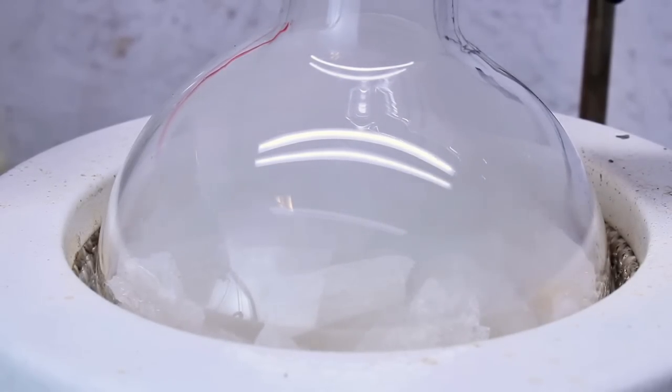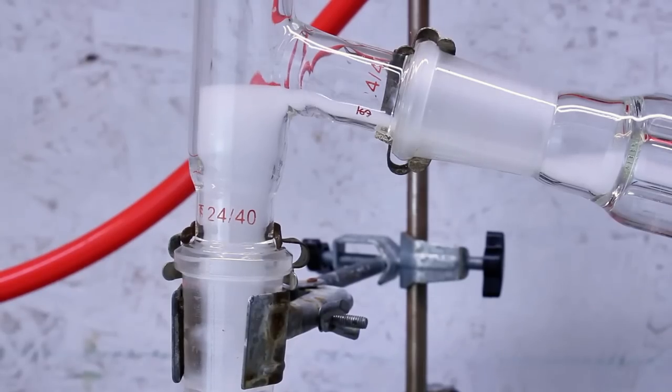The heating mantle is cranked onto max, which in my case is about 340 degrees celsius, and that quickly melts the polystyrene. It then begins to break down and give off an extremely dense white gas, which condenses into a translucent yellow liquid and drips into my collection flask.